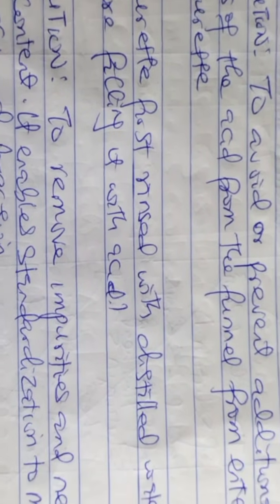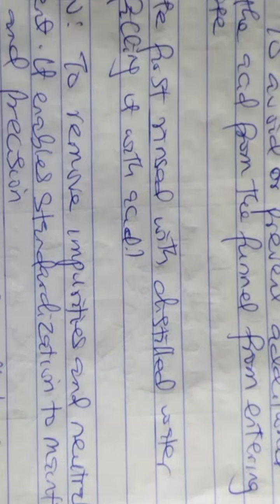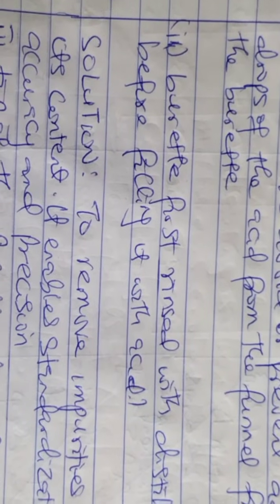Then II says, why is the burette first rinsed with distilled water before filling it with acid? Solution: to remove impurities and neutralize. Remember that this water has a pH of 7, and neutralizes its content that comes to the burette.